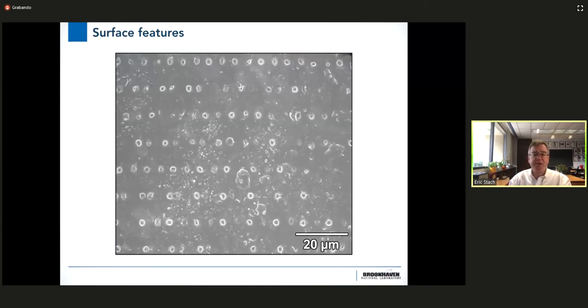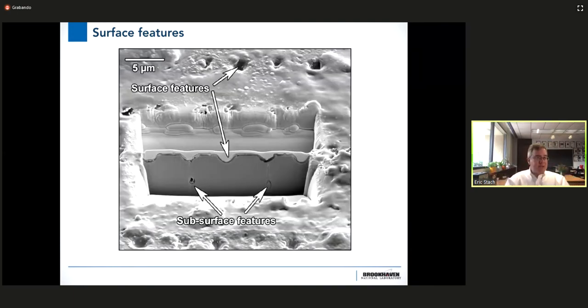What this allows you to do is use, say, the SEM to take a picture of your sample. And you might think to yourself, I would like to image those dots. In this case, it was a sample of lithium niobate that someone hit with a laser locally in order to create these surface features. And they were interested in seeing what happened at these surface features. So we use the focused ion beam to stream ions into the sample. Ions are heavy, so they ablate the material, and we locally remove sections of the material, leaving behind a thin region.